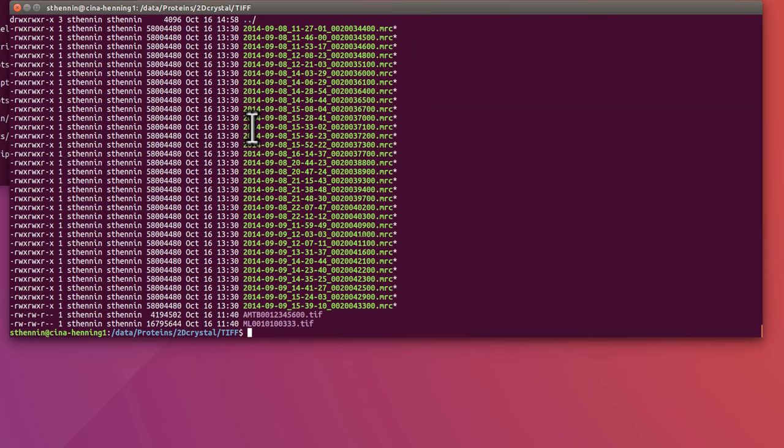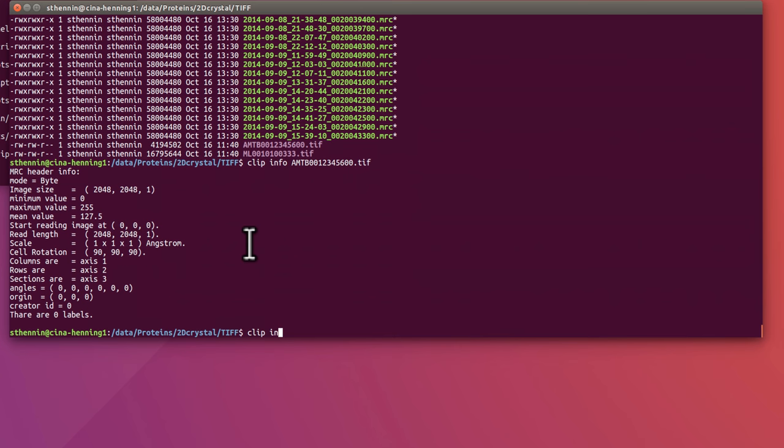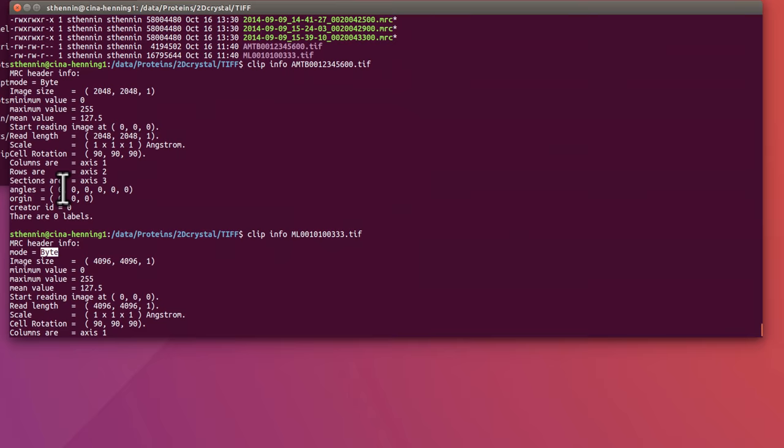So those are essentially 4K images from a K2 camera. There's also two smaller images. This is a 2K image. I think the pixel size is not correct in this MRC header, but it's a 2K image. And the other file is a 4K image with the wrong pixel size. This is mode byte, and the previous ones were mode byte, and before that was mode floating point.